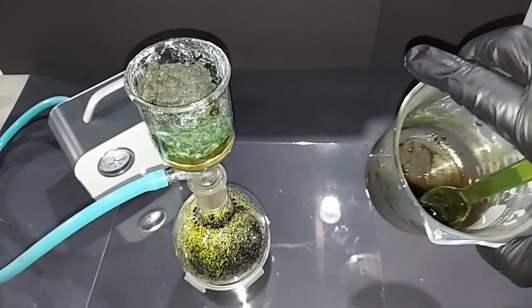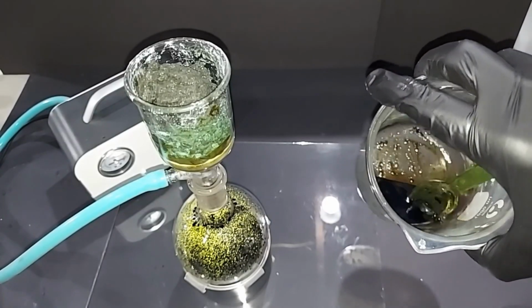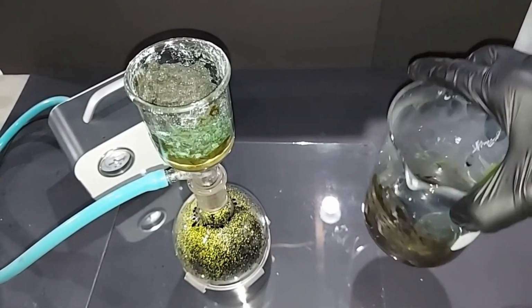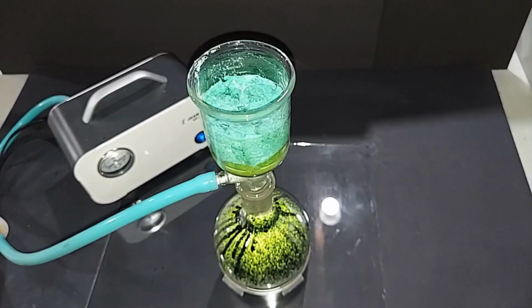Both the liquid in here and down there, I'm going to also boil down, not boil, but dehydrate it and see if I can't get any more out of there. But honestly, I'll probably do that after this whole video is over, because I'm ready to get this thing done. It's been running about 1.5 hours now, and it's pretty much stopped dripping.